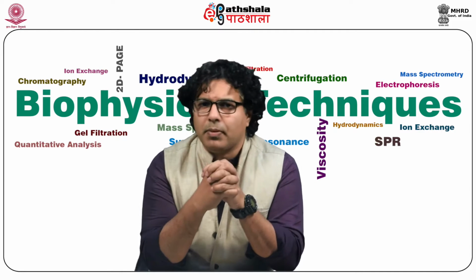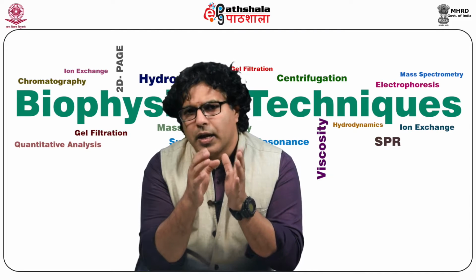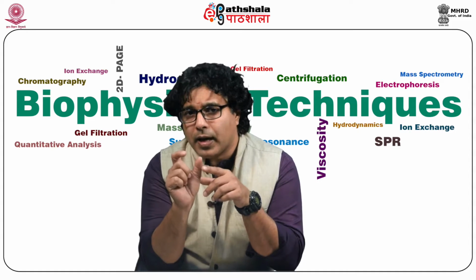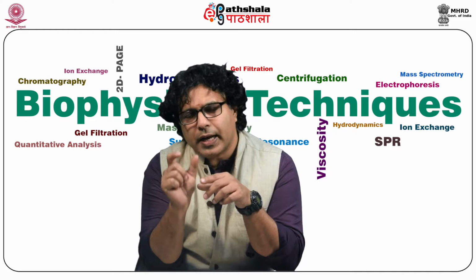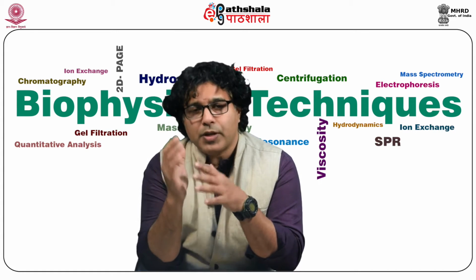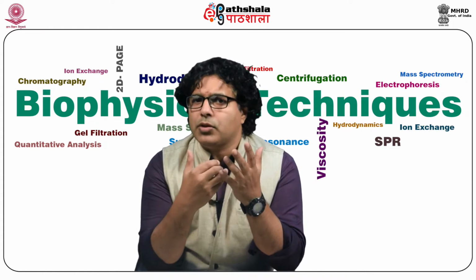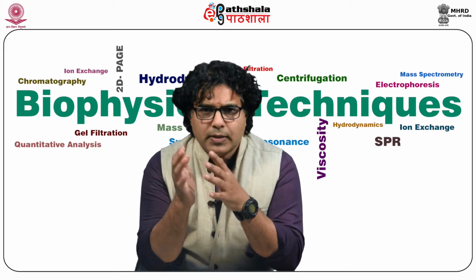For example, take phosphatidylcholine, which has several combinations of fatty acids, but whenever you look at fragmentation, you will constantly get choline. Holding the choline fragment in the quadrupole, we look for the precursors of the ions. These experiments confirm which molecules give a constant fragment ion.